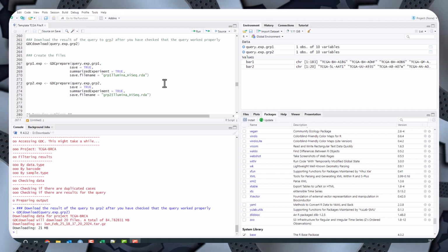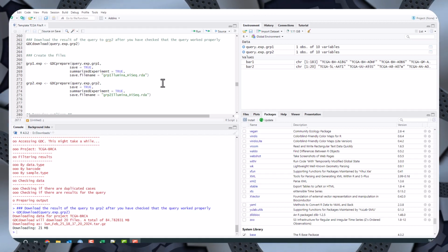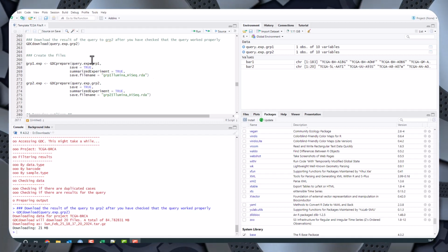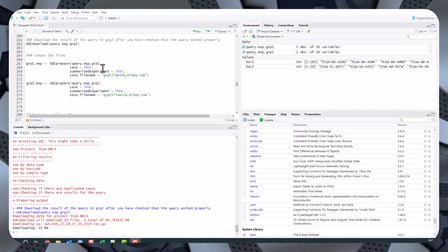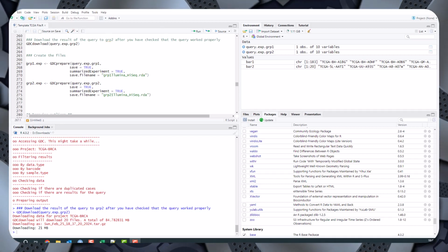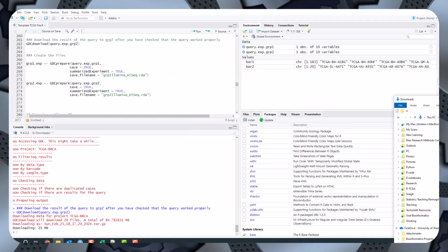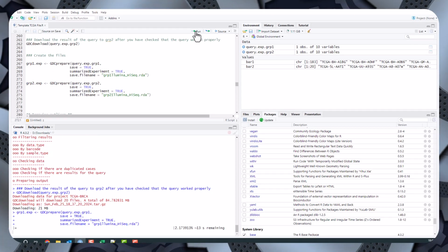Now that you've got all of your data downloaded onto your computer, there's no need to use anything else other than the script for doing most of the processing. We will go back to use a website called David later, but apart from that, everything can be done from within the workflow. So you've got your data in the files here, but what you actually need to do is get it inside R. So that's what this next command does.